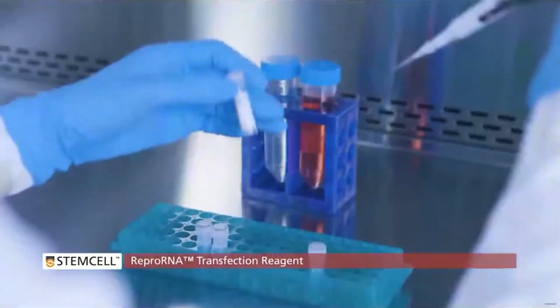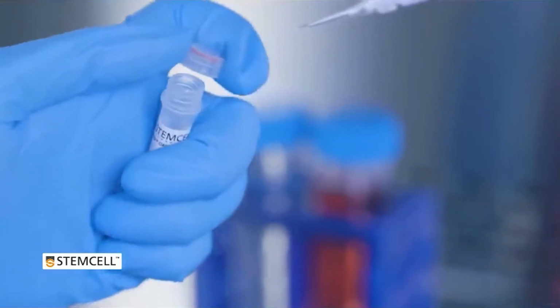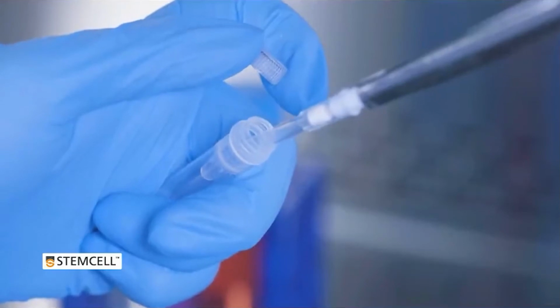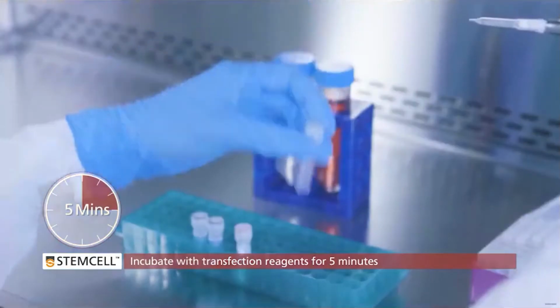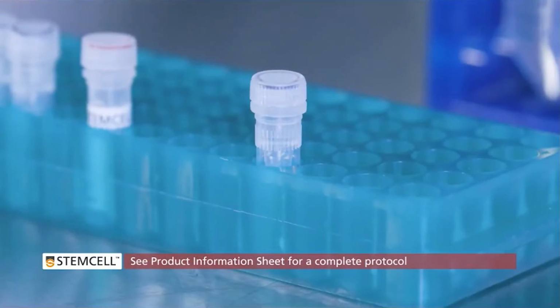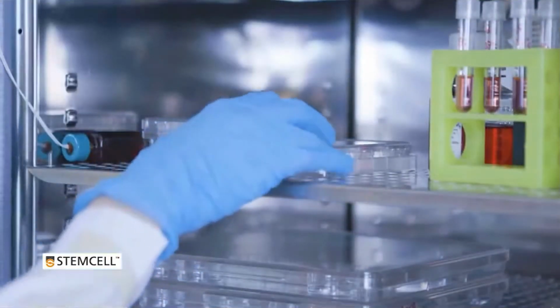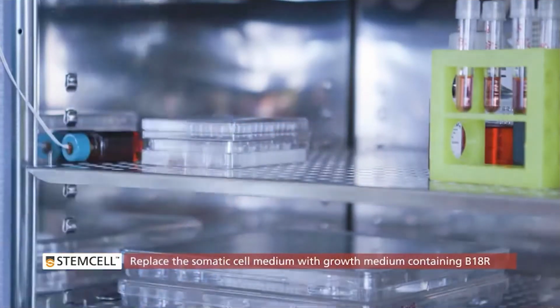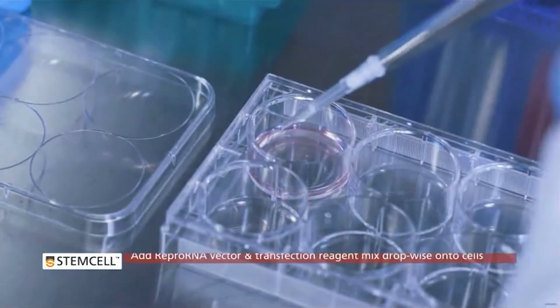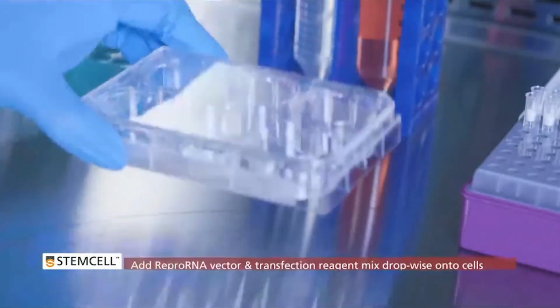The ReproRNA OKSGM self-replicating vector only requires a single transfection. For transfection, we recommend using our ReproRNA transfection reagent. Simply mix the ReproRNA OKSGM vector in a tube with the transfection reagents and incubate for 5 minutes. Take your previously plated somatic cells on a Matrigel or Vitronectin XF coated plate and replace the somatic cell medium with growth medium containing B18R. Add the ReproRNA vector and transfection reagent mix dropwise onto the cells. Gently rock the plate for even distribution.